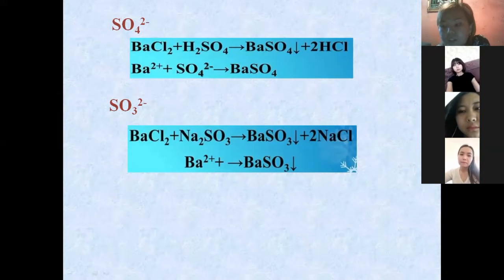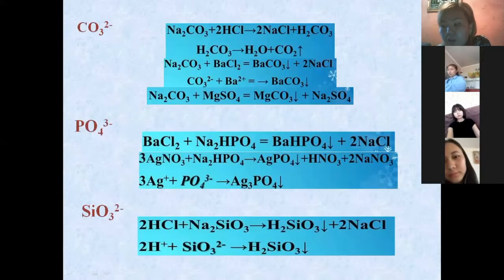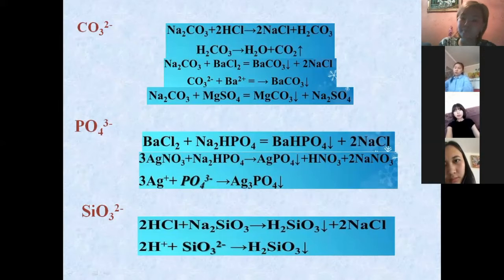Next, let's continue the reaction that we see on the screen. Please, Mireille. If sodium carbonate reacts with hydrochloric acid, we get sodium chloride and carbonic acid. The decomposition of carbonic acid gives carbon dioxide and water.